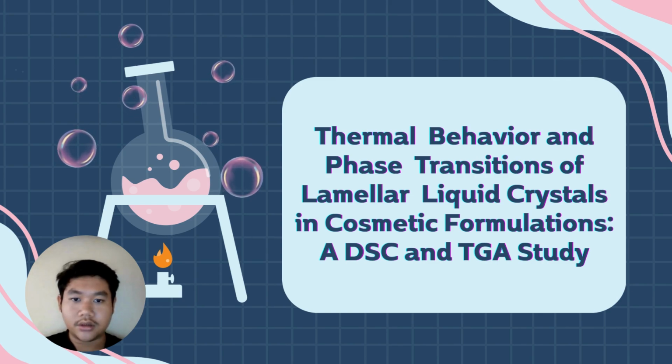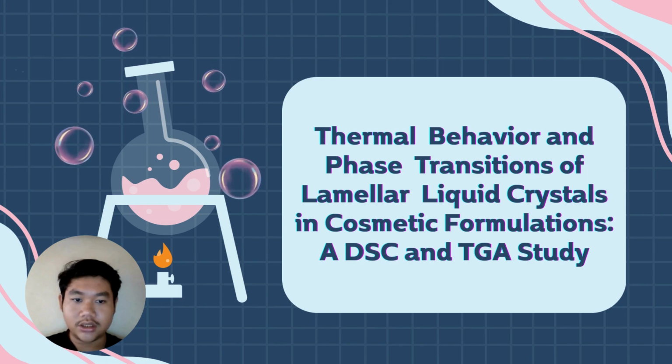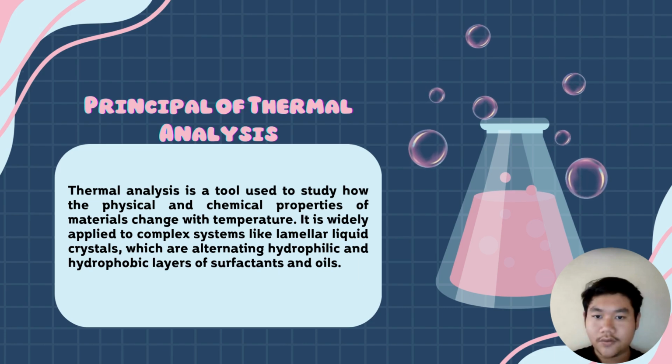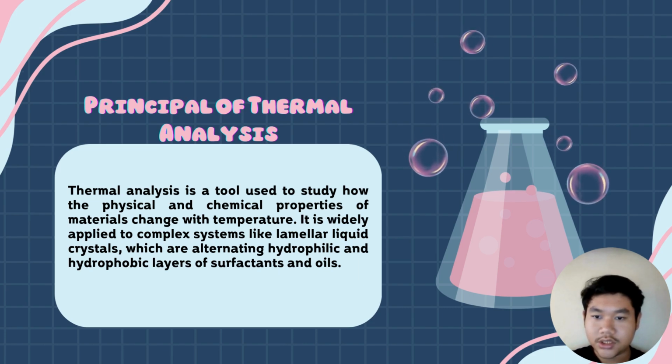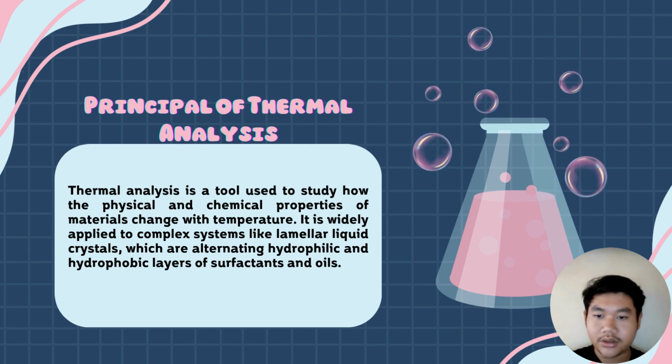Hi everyone. Today we are going to present about thermal behavior and phase transition of lamellar liquid crystal in cosmetic formulation, a DSC and TGA study. The principle of thermal analysis is a tool used to study how the physical and chemical properties of material change with temperature. It is widely applied to complex systems like lamellar liquid crystal, which are alternating hydrophilic and hydrophobic layers of surfactant and oil.